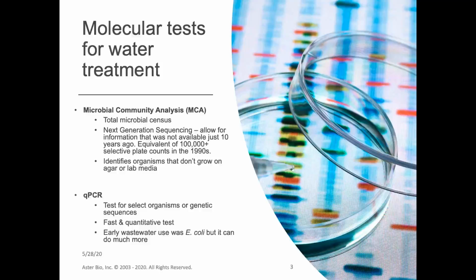The second tool we'll be talking about is quantitative PCR, which is abbreviated as qPCR. This is a very specific test that looks at key microorganisms within a system, such as the ammonia oxidizing bacteria or key Archaea that help in anaerobic digesters.